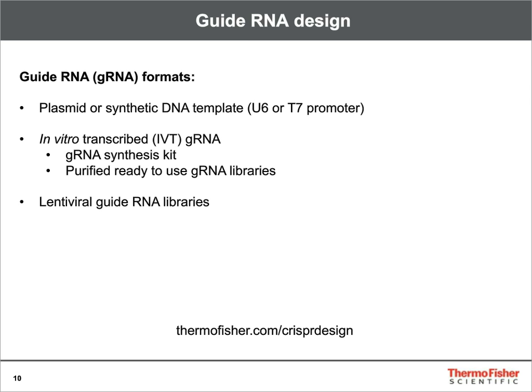One can express the guide RNA off of a DNA plasmid, or express the guide RNA from a synthetic double-stranded DNA template containing a U6 promoter that can be used for endogenous expression of the guide RNA within the cell, or use a synthetic DNA containing a T7 promoter to synthesize guide RNAs by in vitro transcription. You could also use guide RNA synthesis kits to generate purified guide RNA. And I'll walk you through one of the methods that we have developed here within Thermo Fisher Scientific.